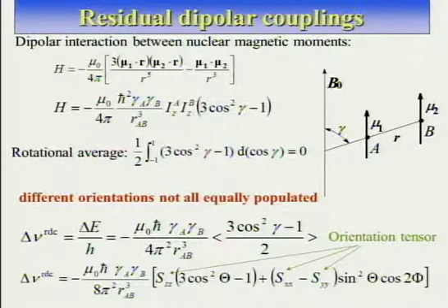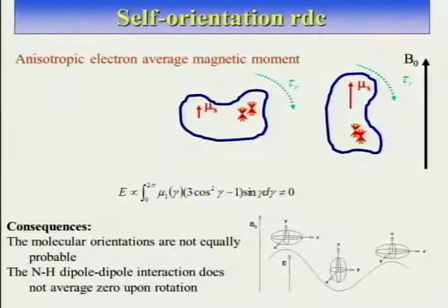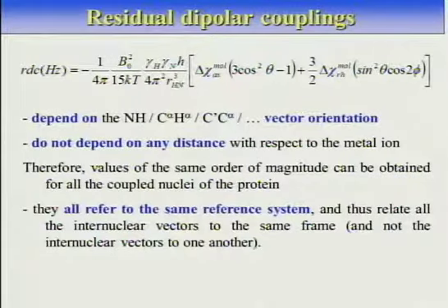And this is self-induced, at variance with what we described before, where you had this alignment media and the protein was orienting because of interaction with the molecules that were in their turn oriented in the NMR tube. Here the protein is orienting by itself spontaneously against the field because of these paramagnetic effects. And because of this, you again get measurable residual dipolar couplings.